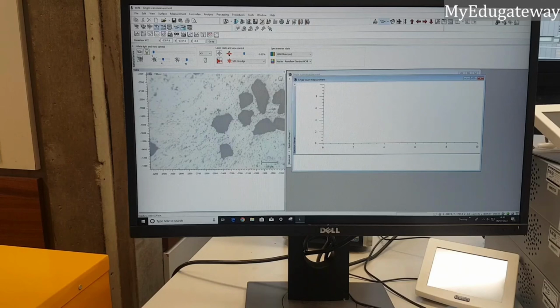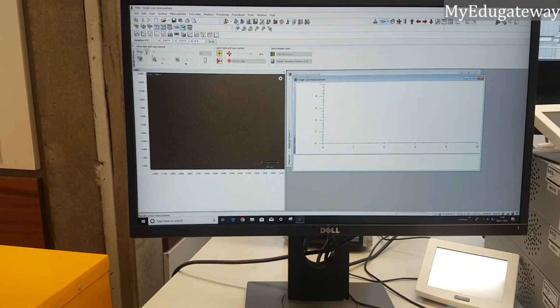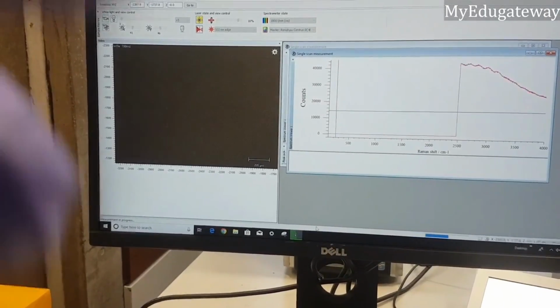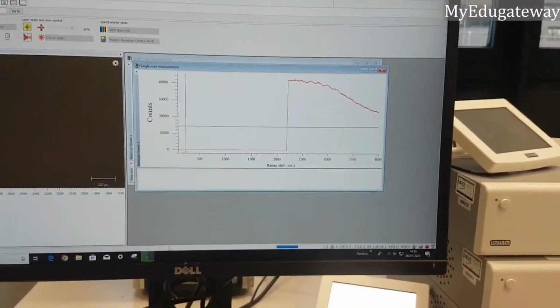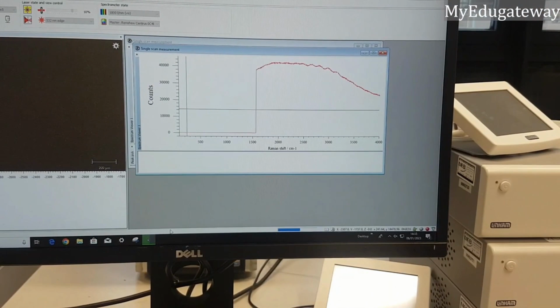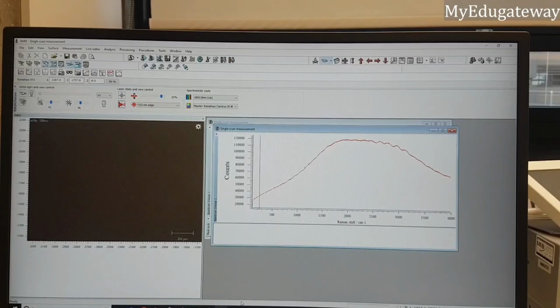Okay, so just click on run. That is the end of this measurement.